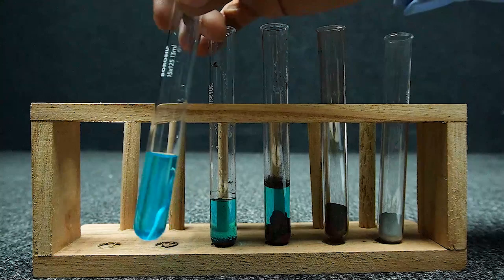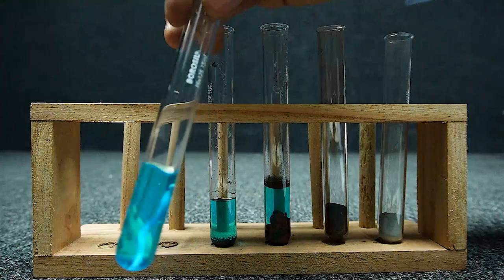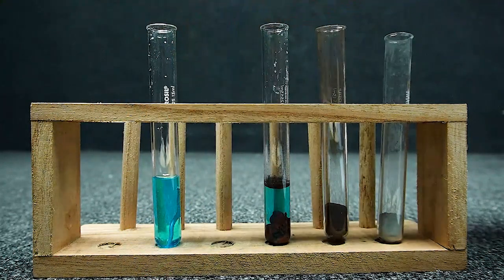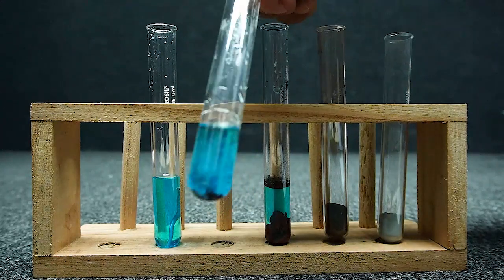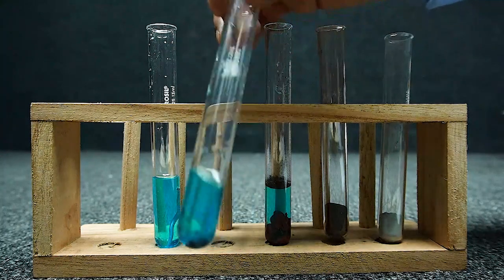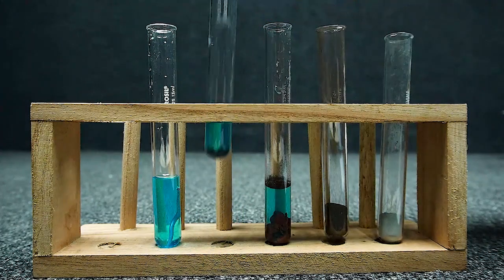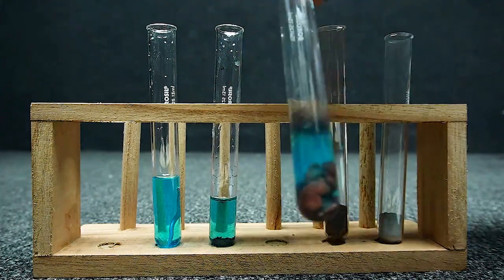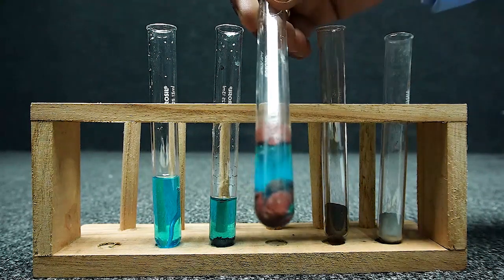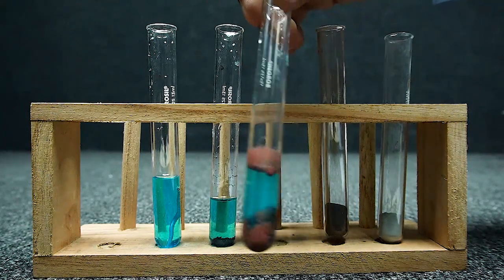The change in the color of copper sulfate indicates the aluminium has displaced the copper. The change in the color of copper sulfate indicates zinc has displaced the copper. The change in the color of copper sulfate and iron powder indicates that the iron has displaced the copper.